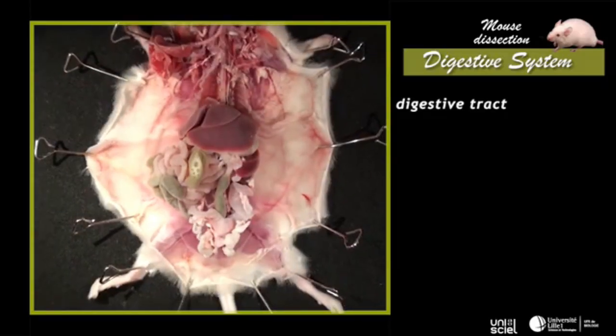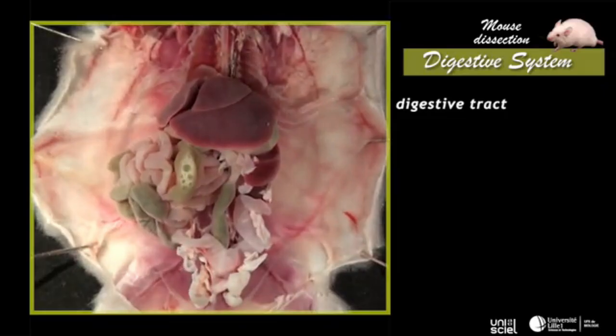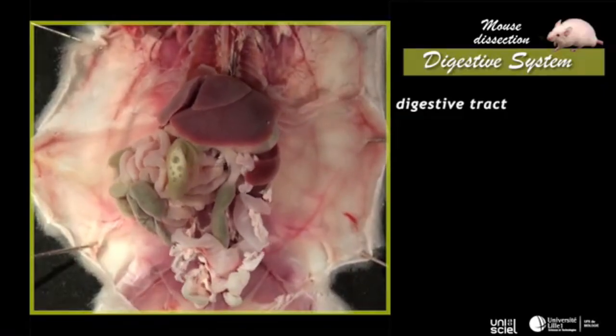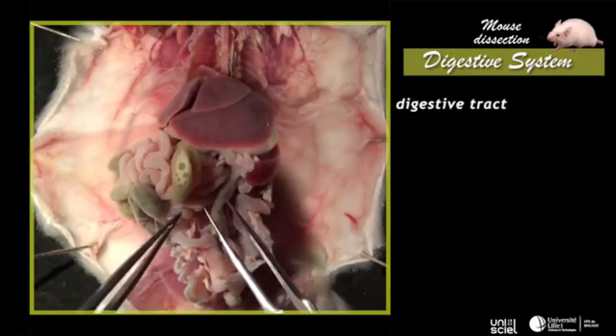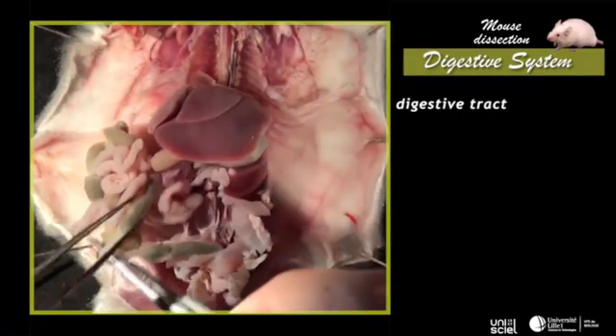The third part of the digestive tract, the intestine, is limited to the abdominal region and is divided into the small intestine and the large intestine. To observe these regions, the digestive tract has to be unrolled by going gradually back from the rectum up to the stomach.